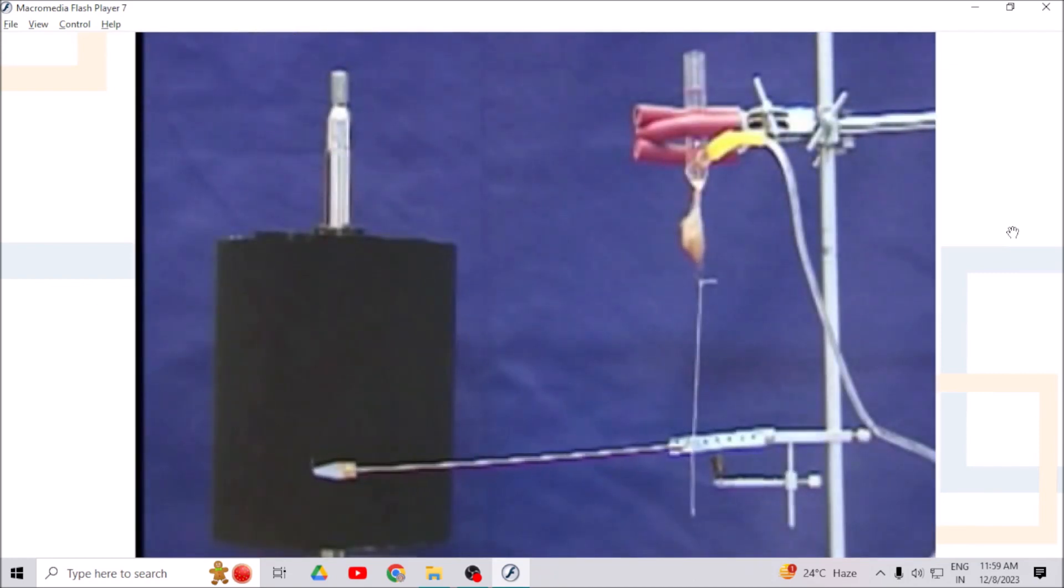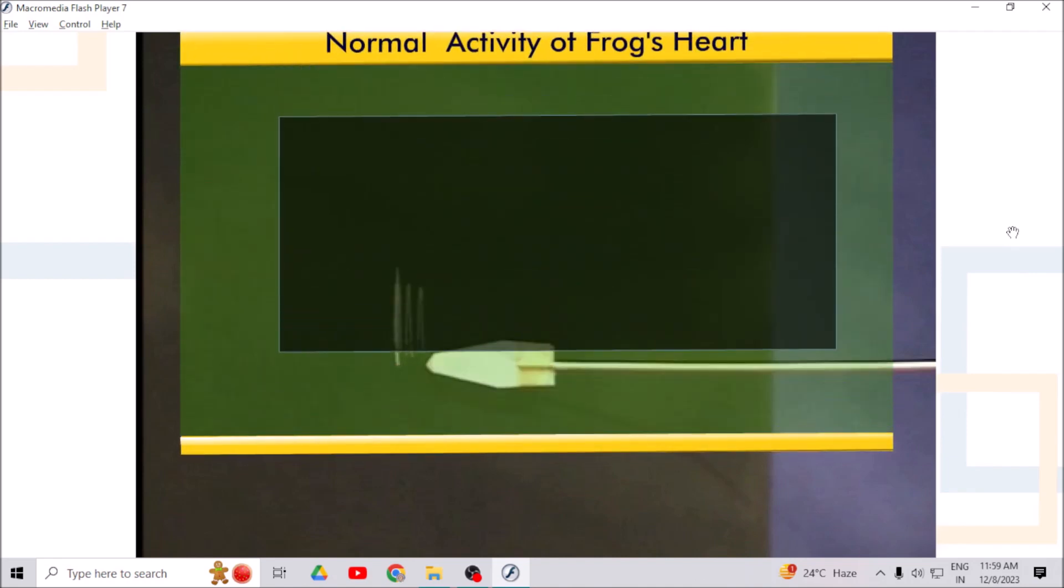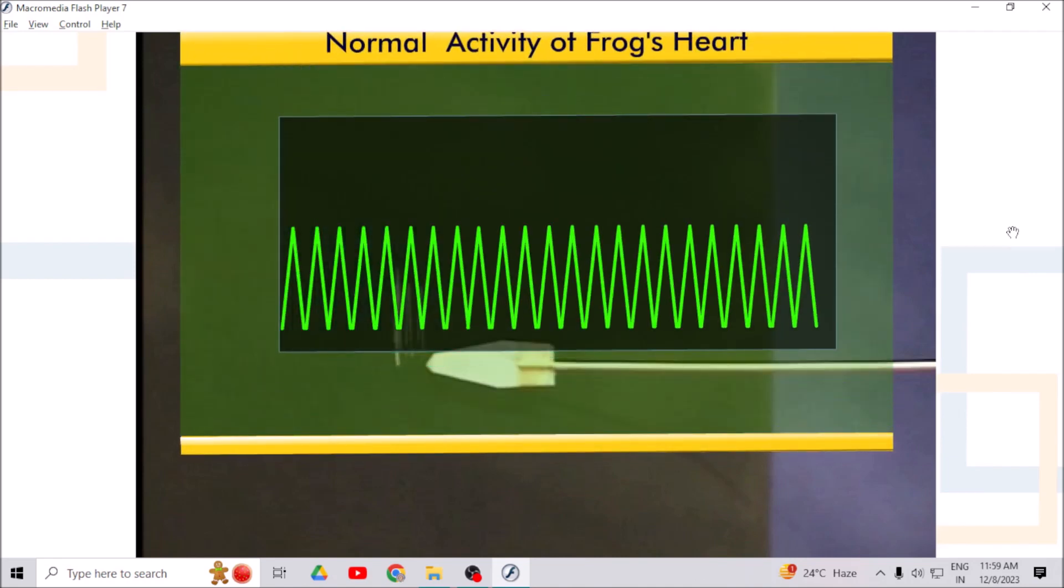Now start the drum and record normal contractions of heart on smoked paper for one minute. From the pattern recorded on the drum you can see contractions of cardiac muscle and relaxation of the same.